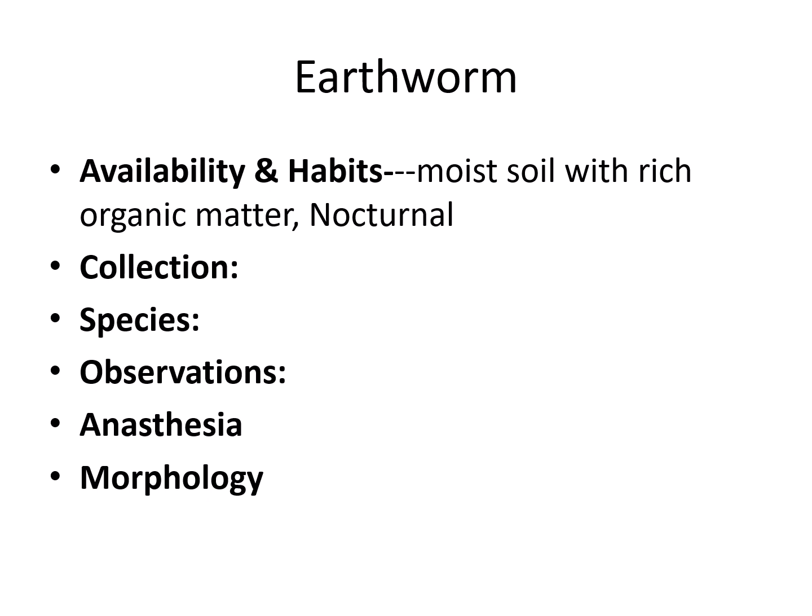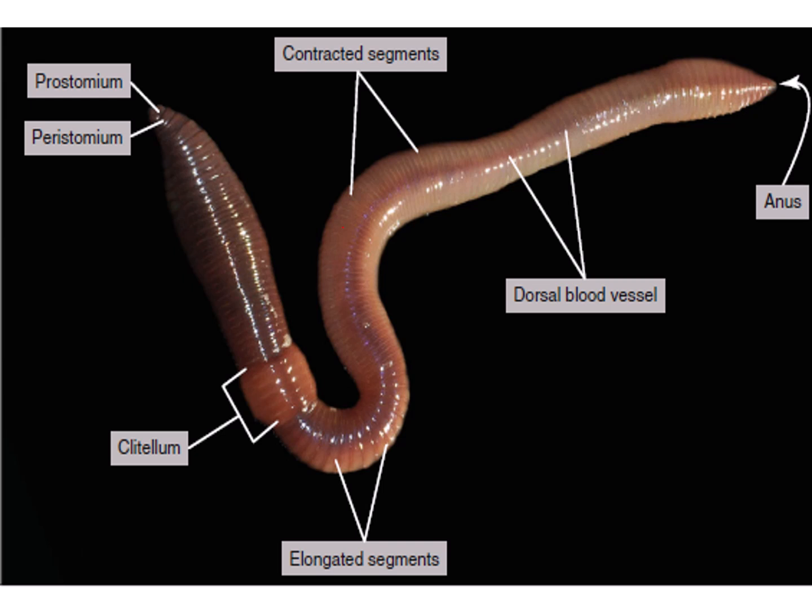Then we have to study their morphology. They belong to phylum Annelida, the phylum of segmented worms. These segments are present internally and externally, dividing the body into segments through a central wall, that is the septum, or dividing wall. These are not present only in the head and the tail region. The rest of the body is divided into complete segmentation.